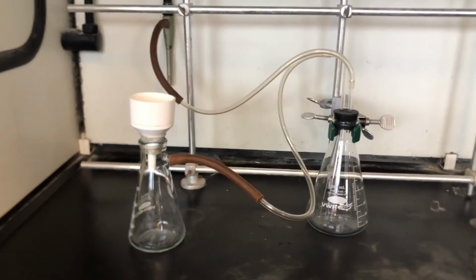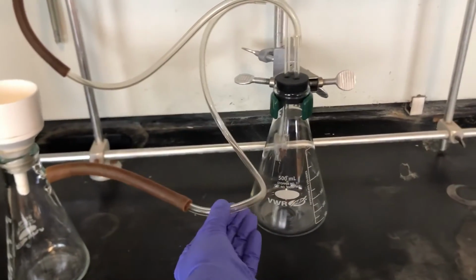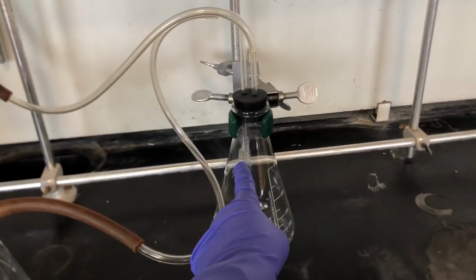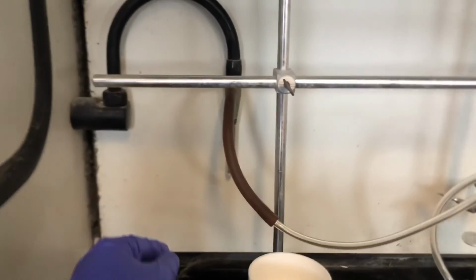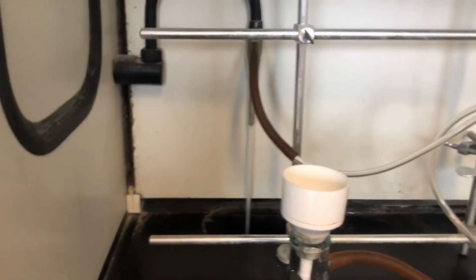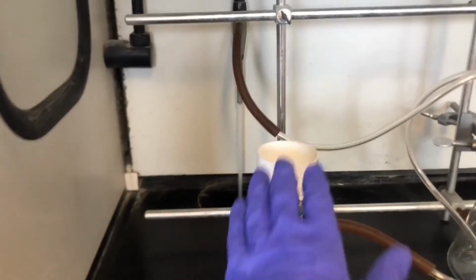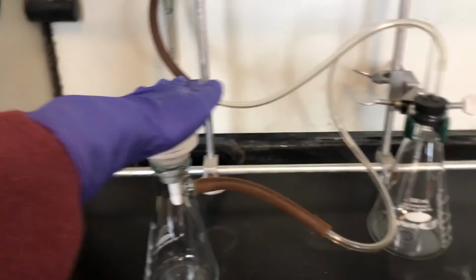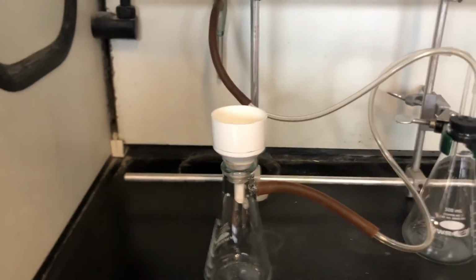And again, I did that so that I could show what was inside of it, but you can see here the tubing leads from the Buchner funnel flask to the trap setup where it will catch any of that runoff, and then that tubing will continue on to the vacuum source, which in this case is a water tap that's sucking the air through the tubing, through the trap, and all the way from the Buchner funnel, creating that vacuum seal that's going to catch all of our liquid runoff.